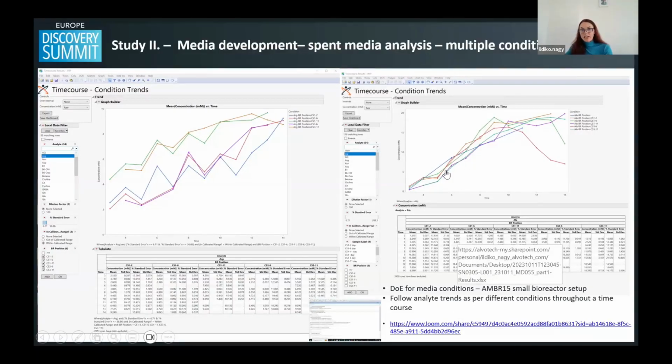Amino acids really show different trending. So the alanine, for example, here shows a completely different pattern in how the cells are growing and dying after a specific day. It shows really different trends, which is very, very valuable and important information for us when concluding the study. And also, if we would like to make an emergency feeding strategy change day by day, the lab can measure every day all the analytes in all conditions, and we can see that really fast with this workflow.